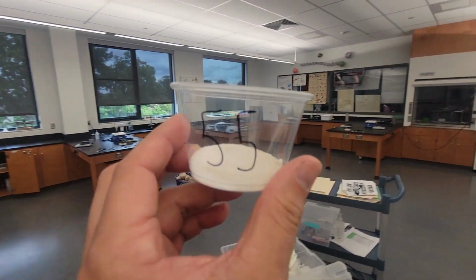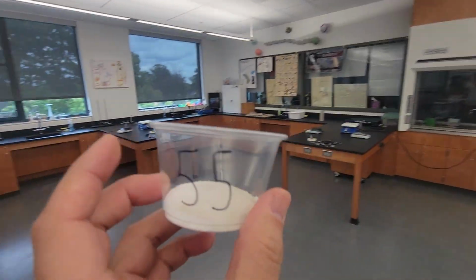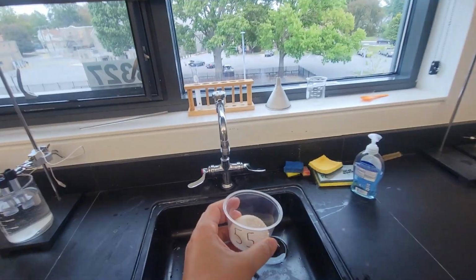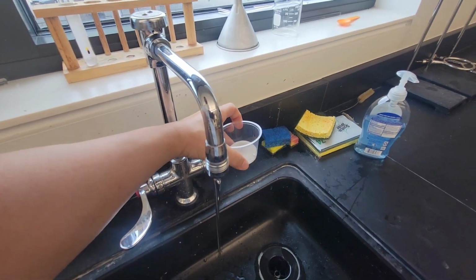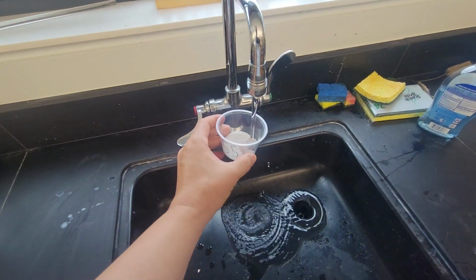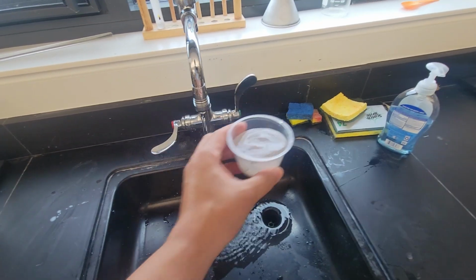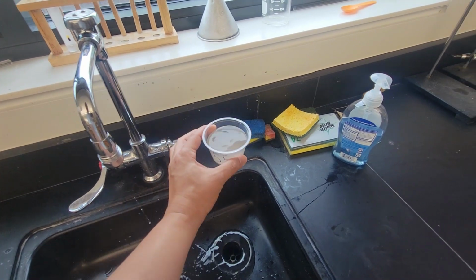Let's add some water to dissolve the salt in our mixture. Should have used warmer water because then it'll dissolve a little bit more.